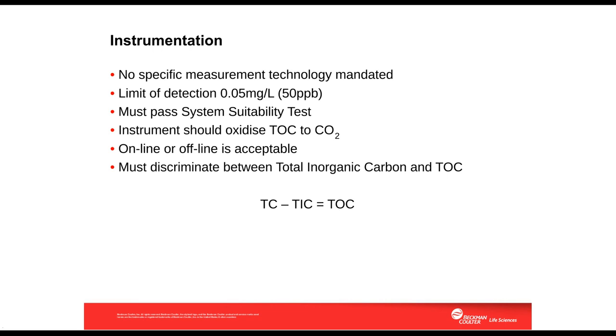Now, USP 643 does not mandate the measurement technology that should be used to measure TOC, just that whatever is used should have a manufacturer's specified limit of detection of 0.05 milligrams per litre, which is equivalent to 0.05 ppm or 50 ppb. Now, that it should pass the test for suitability, the System Suitability Test.